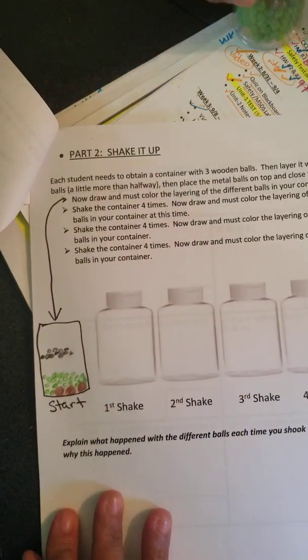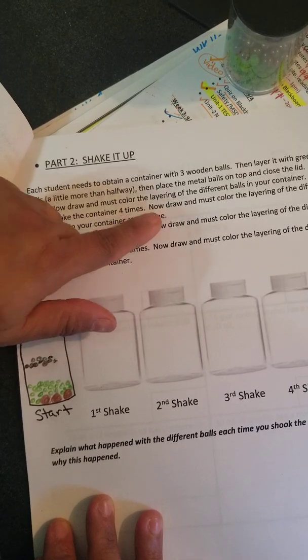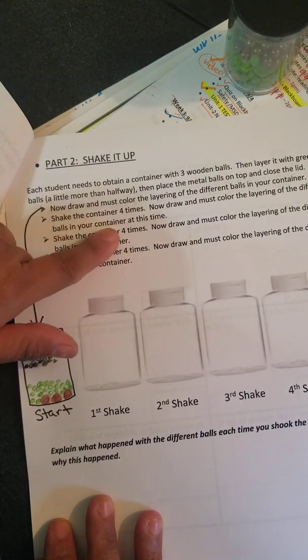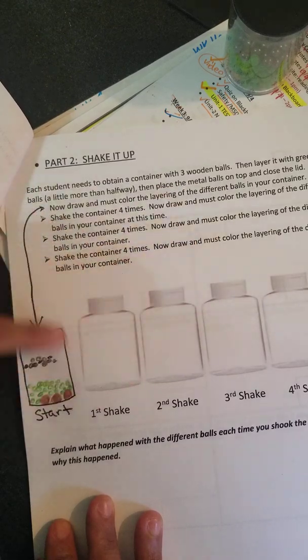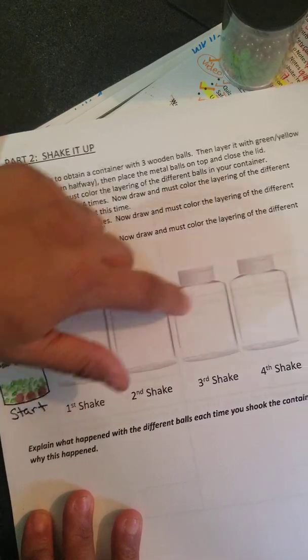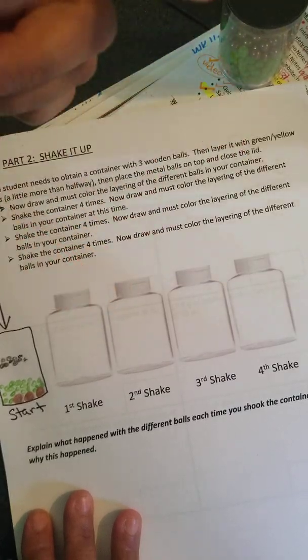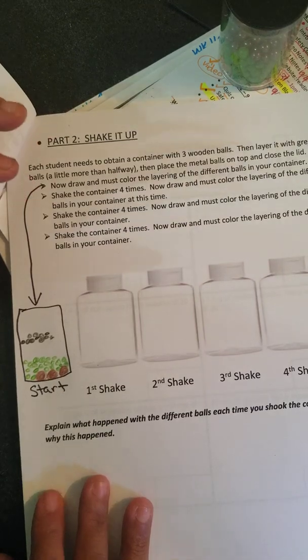Now let me go ahead and read the directions, see where we're at. It says go ahead and shake the container 4 times. Now draw, and you must color the layering of the different balls in the container at this time. Shaking the container 4 more times. Now draw it again. And then do it again 4 more times. So we're going to do it 4 times, and we're going to shake it 4 times. And I'm going to shake it 1, 2, 3, 4. Okay? And each time you're going to color what it looks like. If you need to, then pause the video.